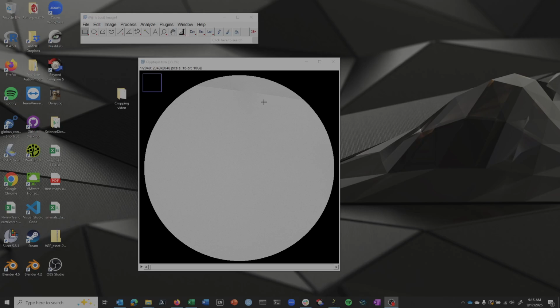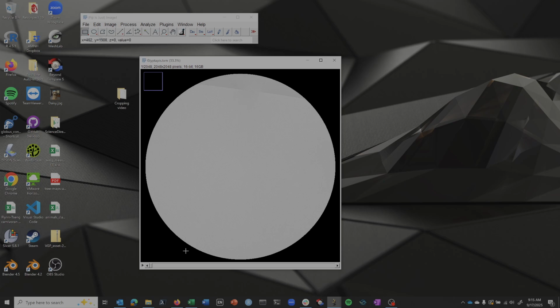I'm going to do another quick video to demonstrate cropping using Fiji. Here I have a CT scan from our Zeiss machine of Glyptapis, a fossil bee in amber. And the first thing you'll notice here as I page through the stack is that it's really kind of saturated, doesn't look very good, it's kind of hard to see some detail.